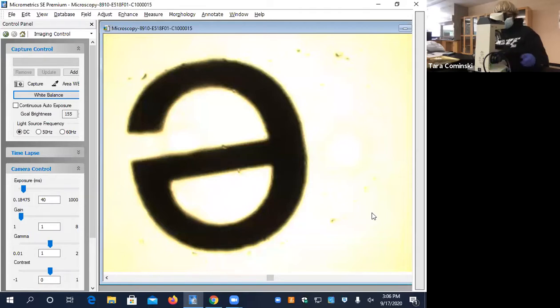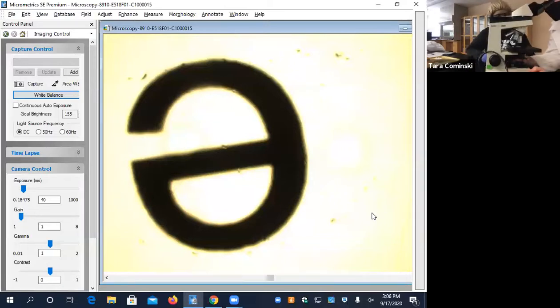Yeah, I'm gonna need your help. That's right. All right, so let me see here. Oh, with the mask, it's hard to see what is going on here. Something's not right with this thing, by the way.